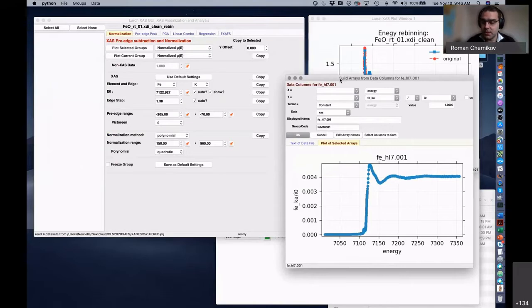Sometimes we see that the amplitude of the XAS oscillations, for instance, from the fluorescence measurements is higher than for the transmission ones. Or the amplitude of the XAS on the distorted material is as high as on the reference. There's no damping connected to the Debye-Waller factor visible. Why could this be?